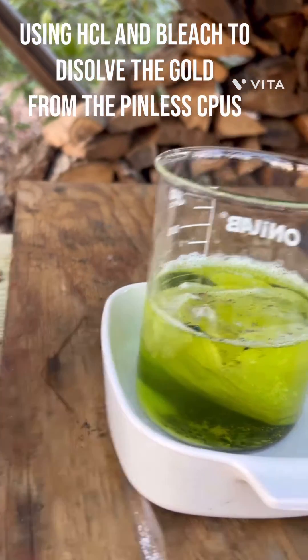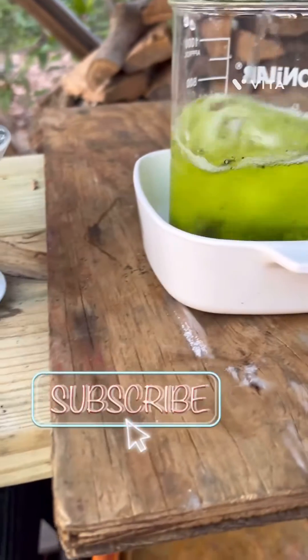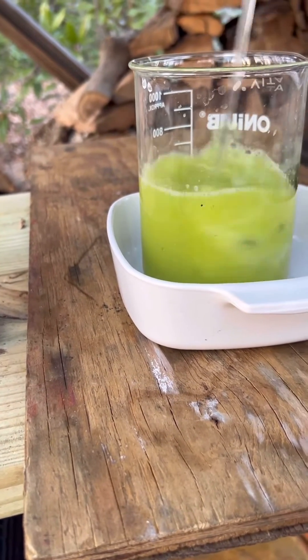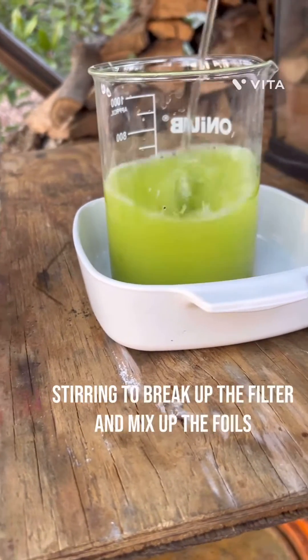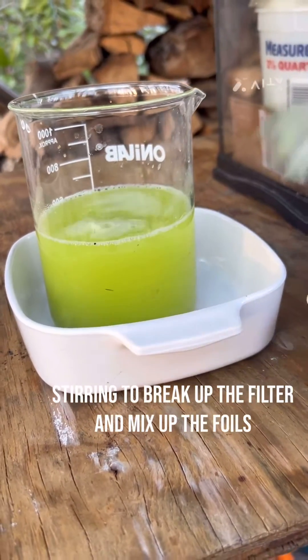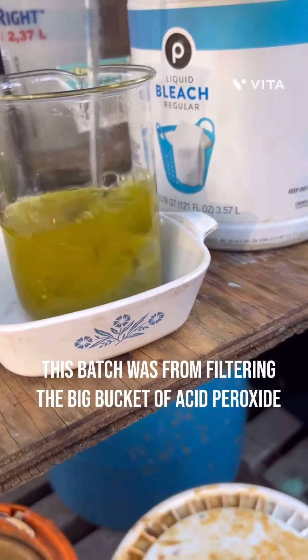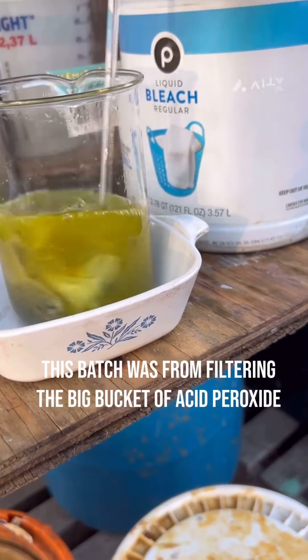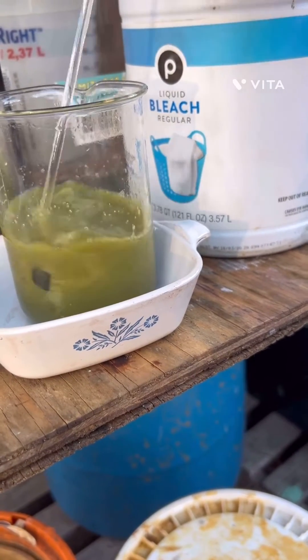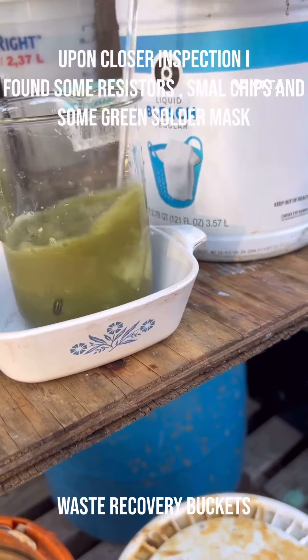Here we have the pens sitting in bleach and hydrochloric acid. We're gonna give that a little stir, hope it dissolves. Filter that up a little better — this was the first batch that I had filtered out. The AP is a little nasty but that's why we separated it; we're going to filter it out again to clean it up.